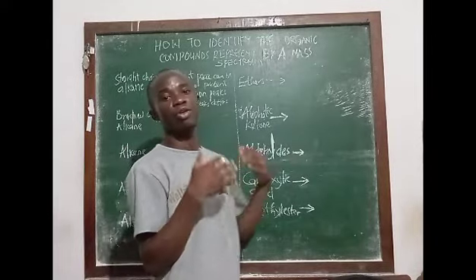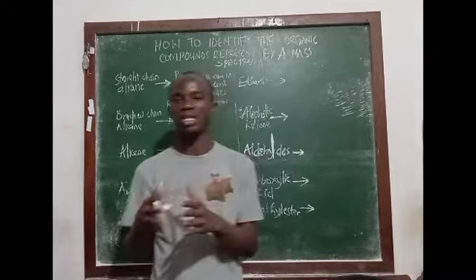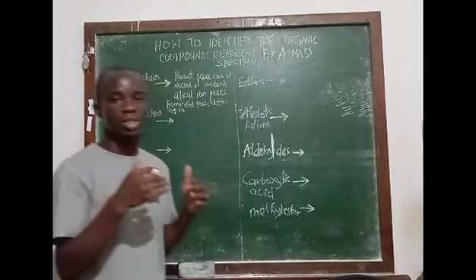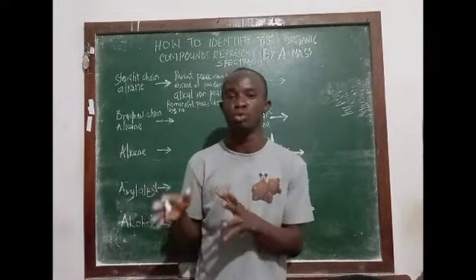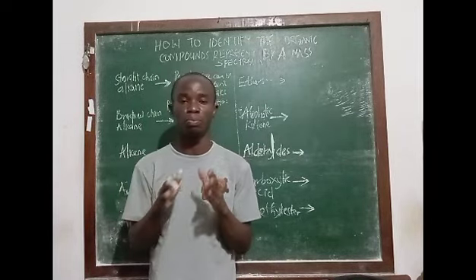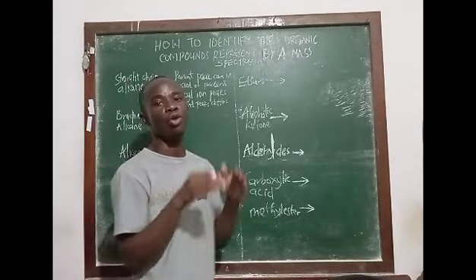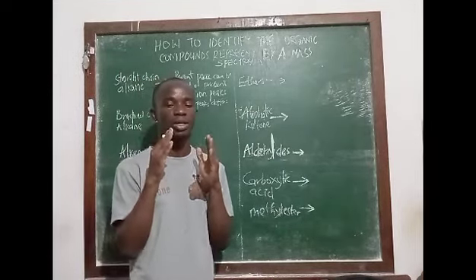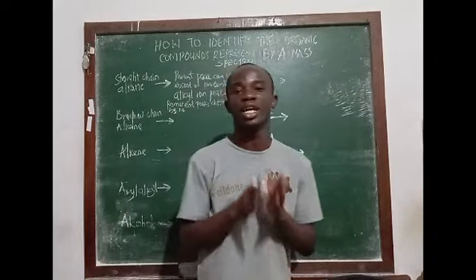So you can see a peak for methyl, ethyl, propyl, butyl, pentyl, hexyl, heptyl, octyl, etc. But like I said, not all of these signals will be prominent. The most prominent of these alkyl ion peaks will either be for the propyl ion or for the butyl ion, and that's how to know a mass spectrum that identifies a straight chain alkane.